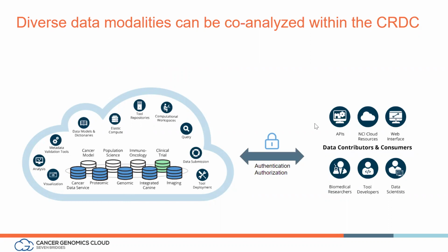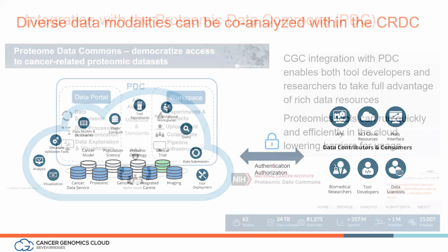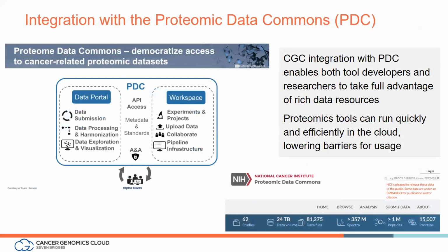And there's contributors and consumers. We like to serve biomedical researchers, tool developers like Felipe and myself. It's good for tool developers because essentially everyone on the workshop is going to be testing this tool today at scale, as well as data scientists. And there's lots of ways to interact here. So the key integration we're focusing on and why everyone is interested in this is the integration with the Proteomics Data Commons.